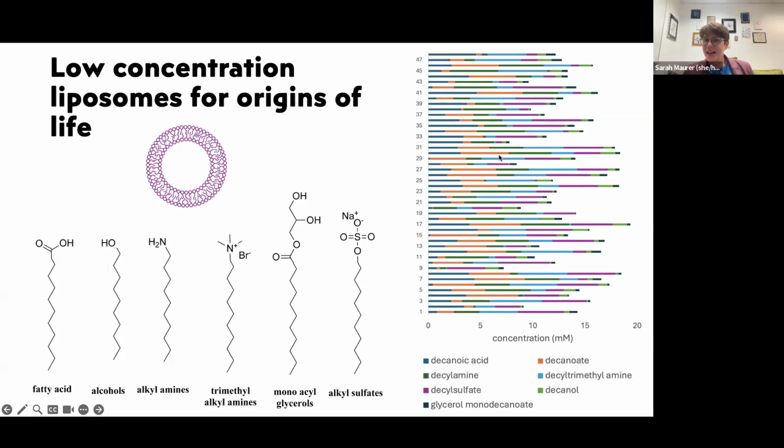All right. The next question, could you comment on the stability of these vesicles over time? I cannot, but I would say days, because we make the plates and then we run microscopy not the same day. How long do they maintain size distributions? Do they fuse? Do mixtures of these vesicles with various fatty acids fuse?